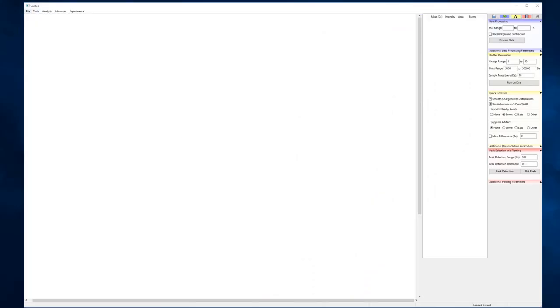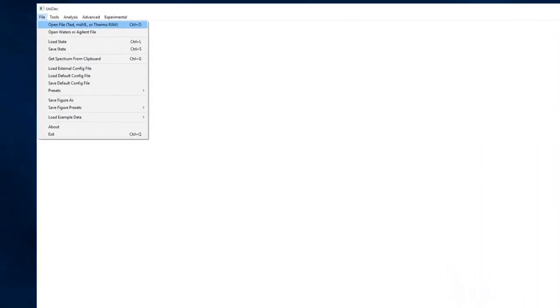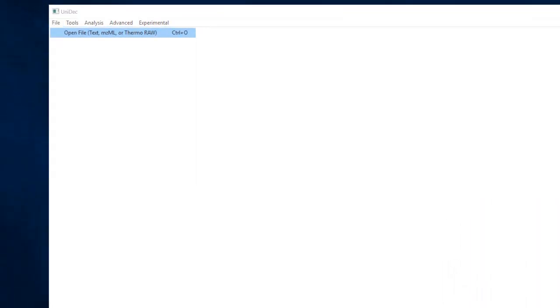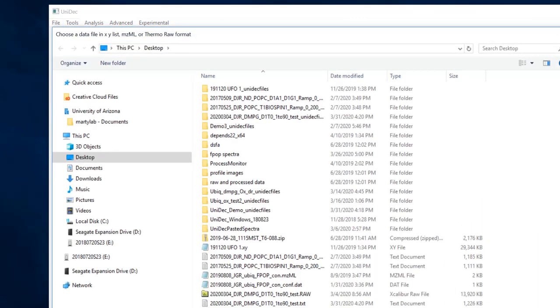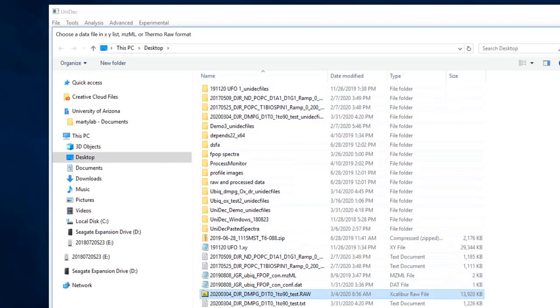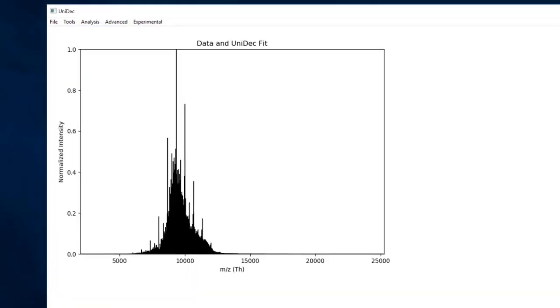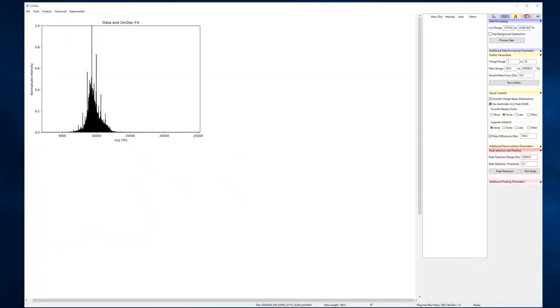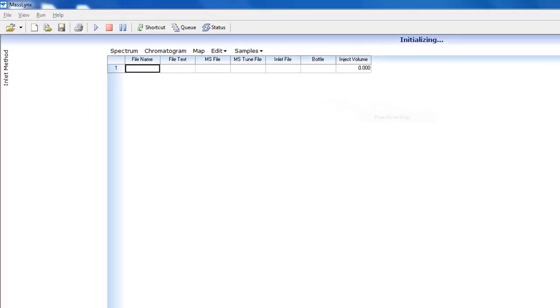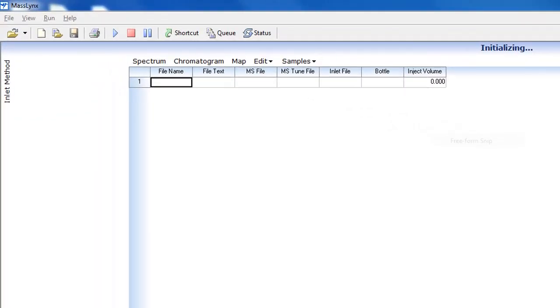After it is registered, you can either open or drag and drop Thermo files into Unidec. It will compress all of the scans together into one. If you want specific scans, you can average them in qual browser and save them separately. You can also try the Unichrome module as well, but we won't be covering that in this video.